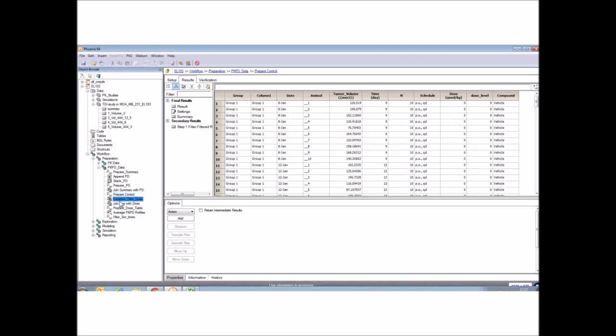And for the next 3 steps, we are actually preparing the dosing table for modeling. So first of all, you select one of the prepared simulation tables. See, here's the QDay 28-day study, and you join that with the tumor volume data to get this kind of dosing table, the first step. Then you need to join the dose amounts and the compounds, and finally do some adjustments and finalize the dosing table. And this can be directly used in the modeling stage.